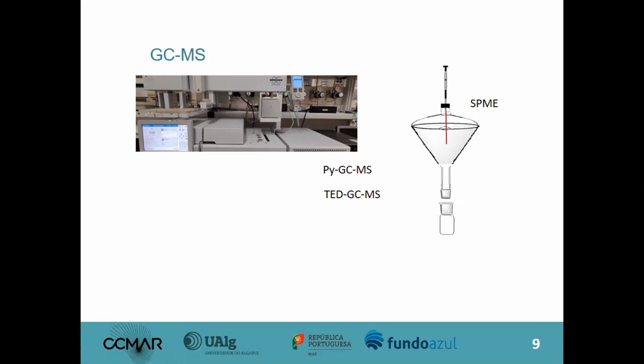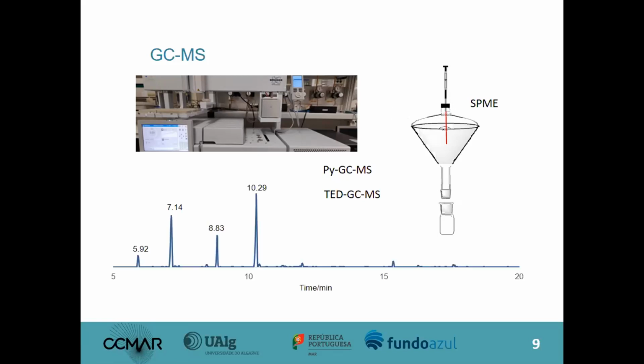We designed one of those systems, and a glass blower constructed it. The result of GCMS is always a chromatogram, like the one I'm showing you here. Each of these peaks corresponds to a single compound. You have a monitoring of the intensity of all ions that are being detected by the mass spectrometer over time, and this is called a chromatogram.